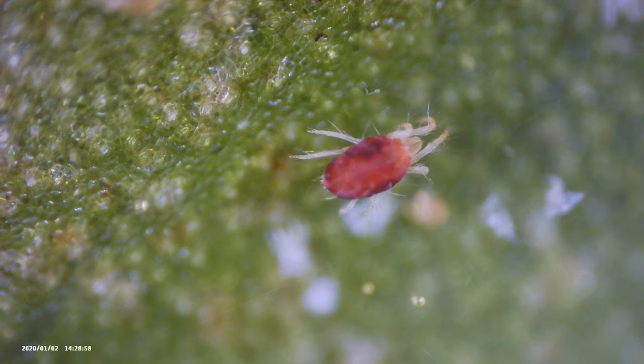What's up guys and welcome back to Tech Plant. Today I'm going to show you some nightmare fuel and we're going to look at houseplant pests up close and personal. Let's check it out.